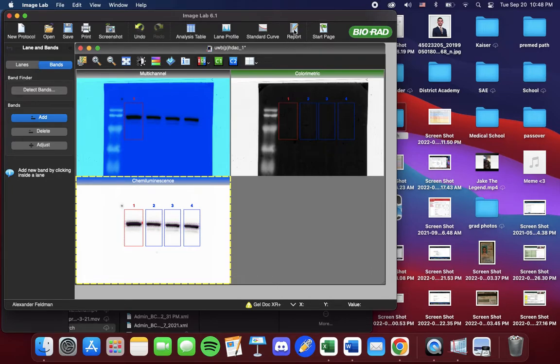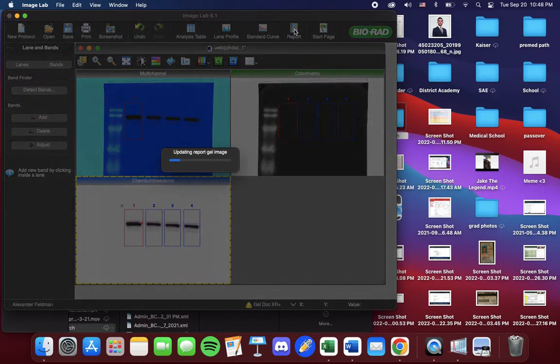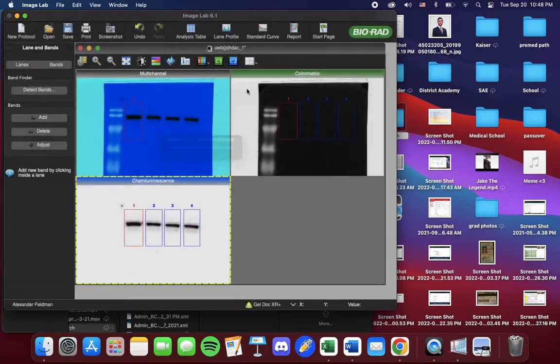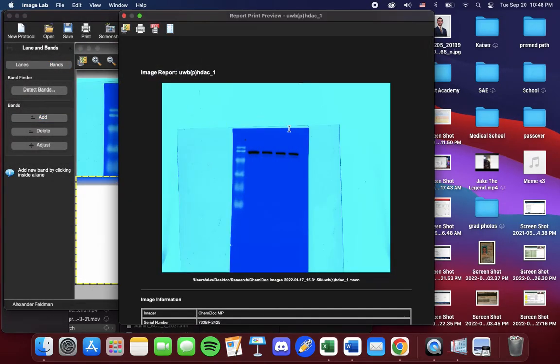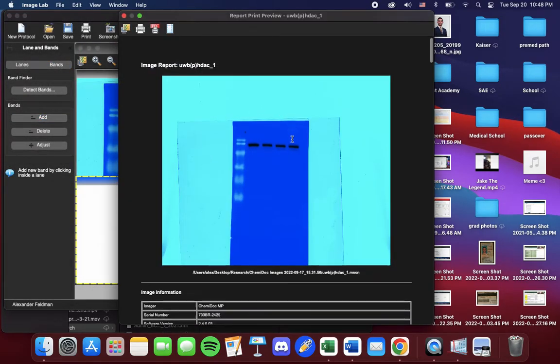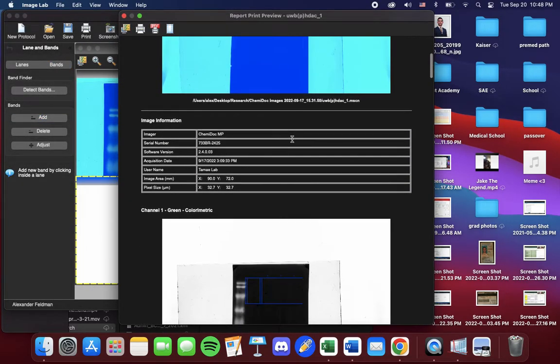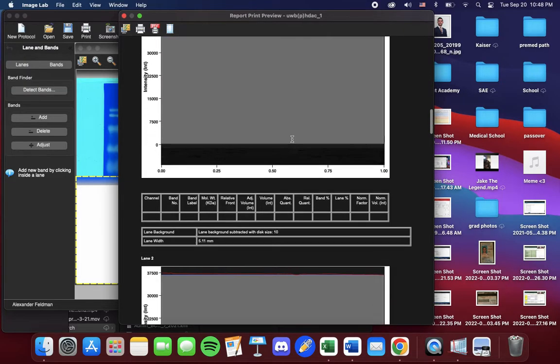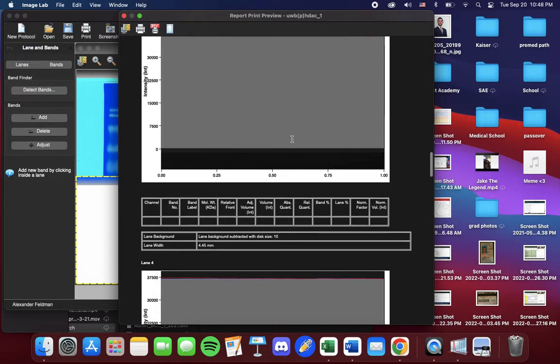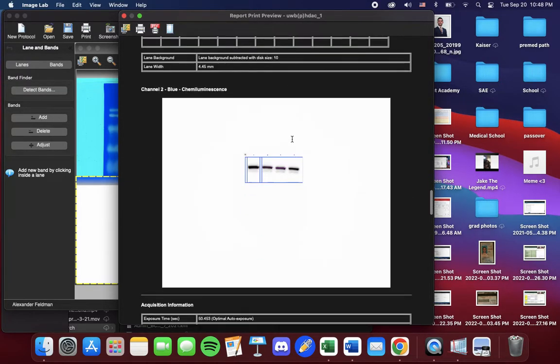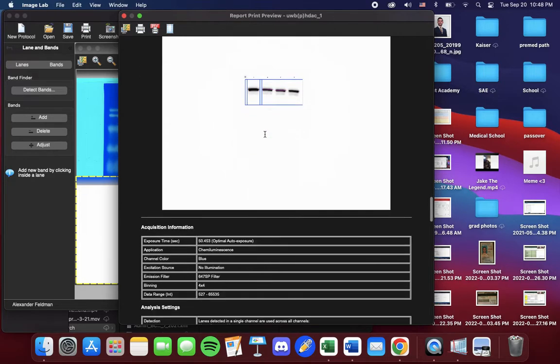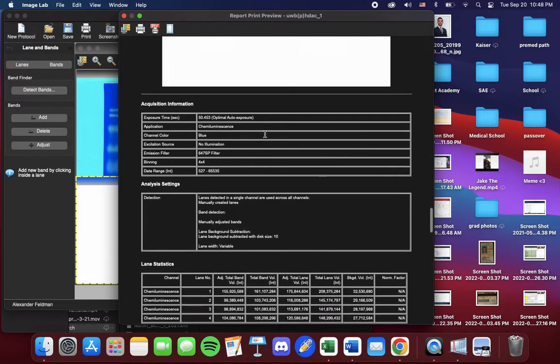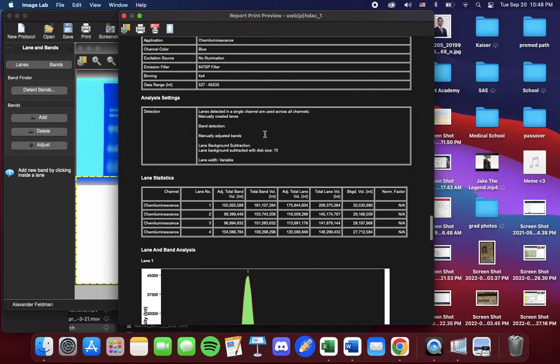Once you click report, a PDF will pop up. You want to scroll down until we find the chemiluminescent blot. Right here, channel 2, chemiluminescent. And under it, we can find our lane statistics.